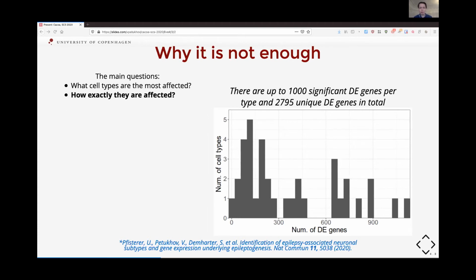So people often do some cherry picking, like picking 5 genes out of 3,000 and claiming that they know these genes and that these genes explain everything. But of course, it's just cherry picking. It's fine that you can find some genes, but it doesn't reveal the whole picture.